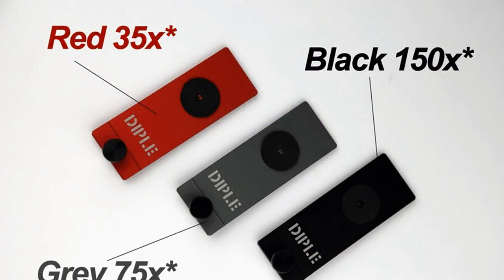The project, dubbed DIPL, is not your traditional lens attachment, as you might have guessed. Unlike the company's previous Blips 5X, 10X, 20X, and 150X lens accessories, DIPL is more a portable platform that doesn't really attach to the phone at all.